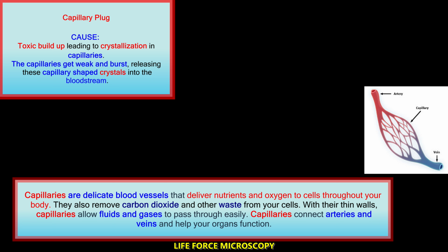It is very common to see these capillary plugs, which come in many different shapes, whenever you are looking at live blood.